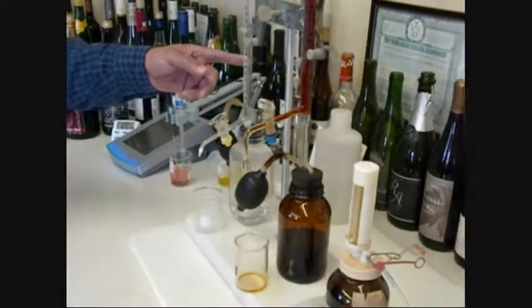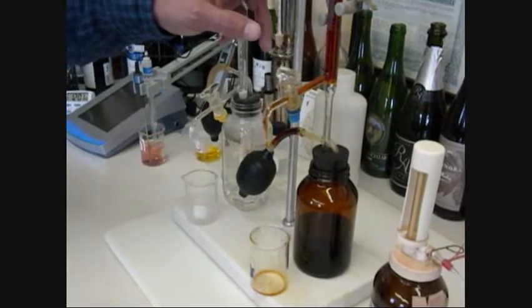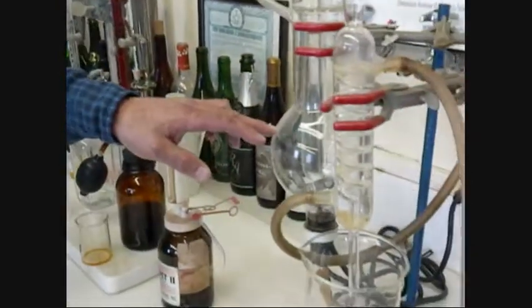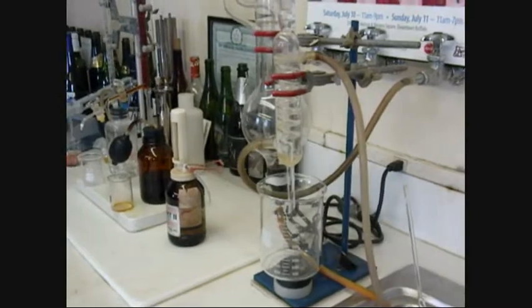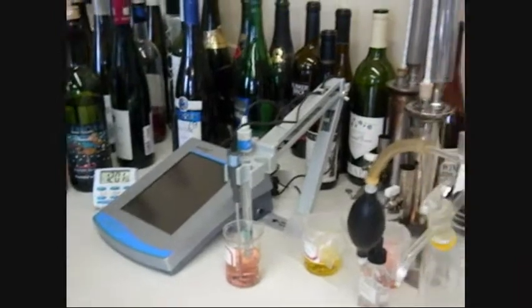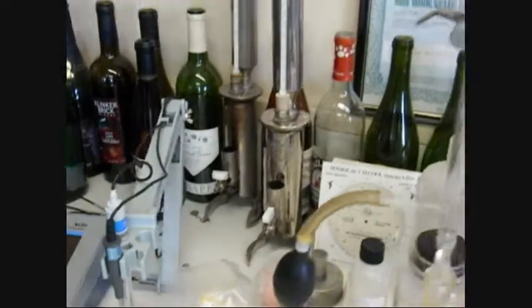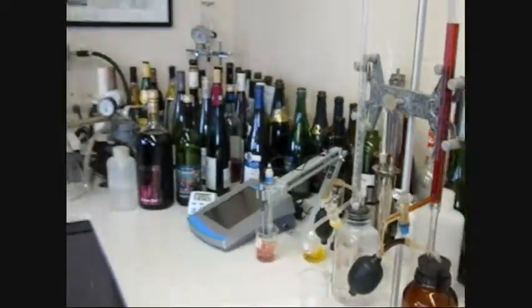Sodium hydroxide is used to check the total acidity. We can check the sulfur as a kind of simple test here. We can test for volatile acidity, which would be vinegar. And then pH, as I mentioned before, is very important, and we have a nice new pH meter and an ebulliometer for alcohol. And there are other things that are more sophisticated than this lab needs to be that we would like to check occasionally, like microbiological stability or even phenolic assays in reds. Those kinds of things we would send out to a lab.